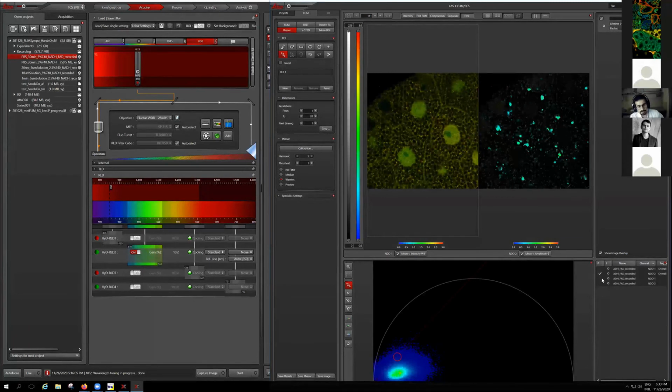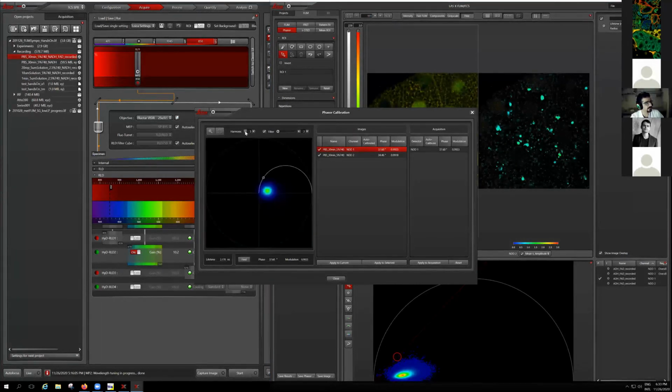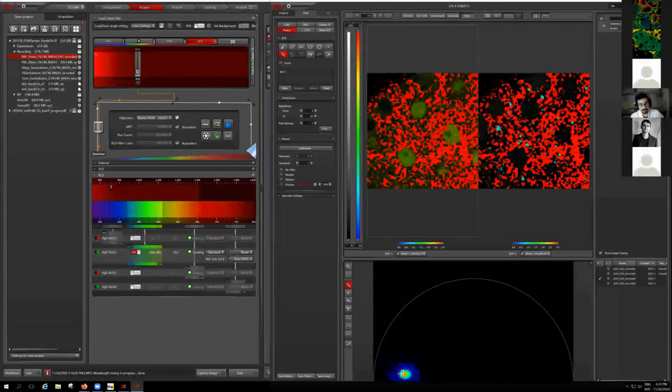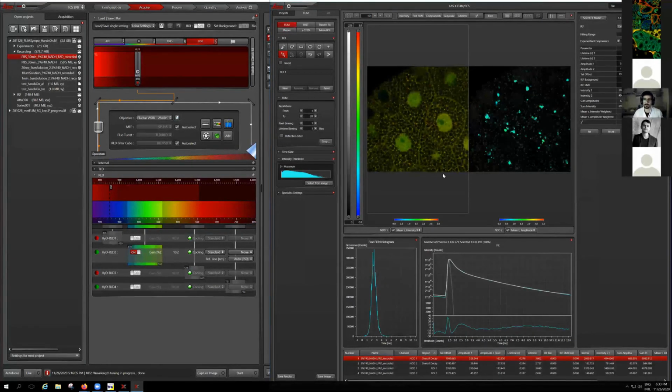Hi, Ali. Yes. Just wondering, why is the harmonic at 9? Can you decrease it by any chance? Pardon? The harmonic, below calibration you have the harmonic. Can you put it at 1? No, I can't. So here, that might be the case that I can reduce it to 1. Oh, yeah. But it needs calibration. That's a problem. Oh, really? Yeah. So that's a point. And I said that it won't be really fancy because the phasor plot on our system needs calibration. So that's another reason we just focus on the FLIM for now.